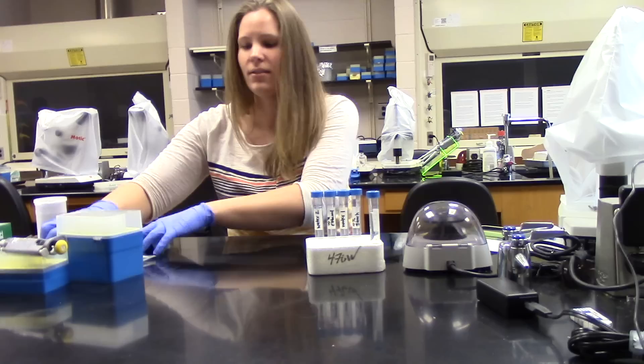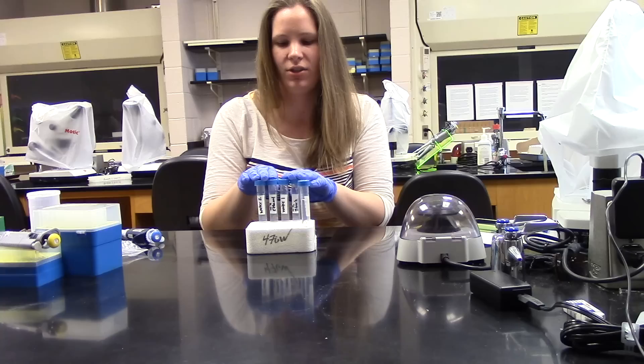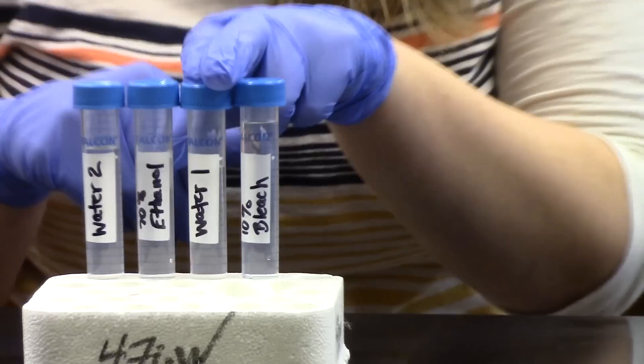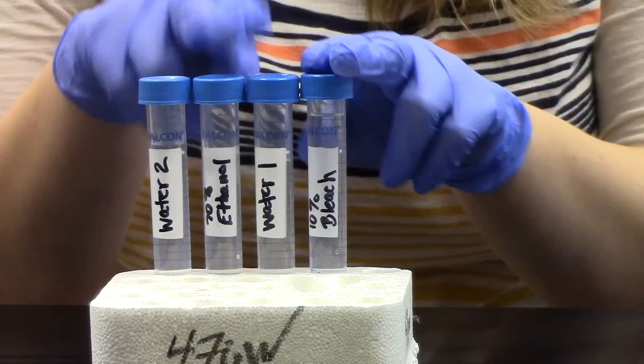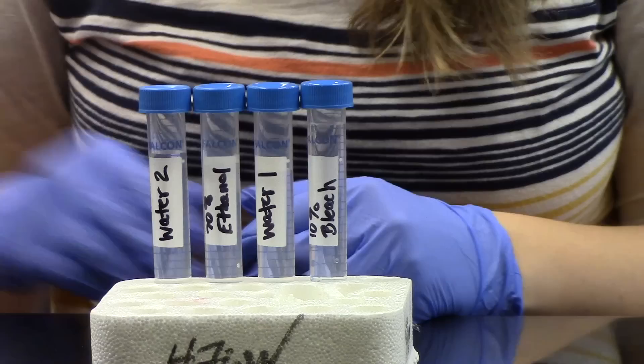Now to sterilize our beetle, we have a floss station here. We are going to begin with bleach, then move on to water 1, then ethanol, then water 2. It is important to keep these waters in this order so that the bleach is fully diluted into the last step. We do not want bleach in our microbiome plates.